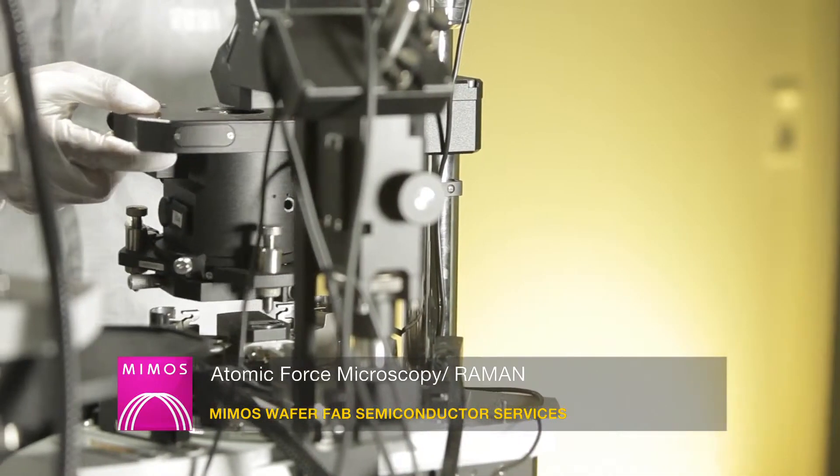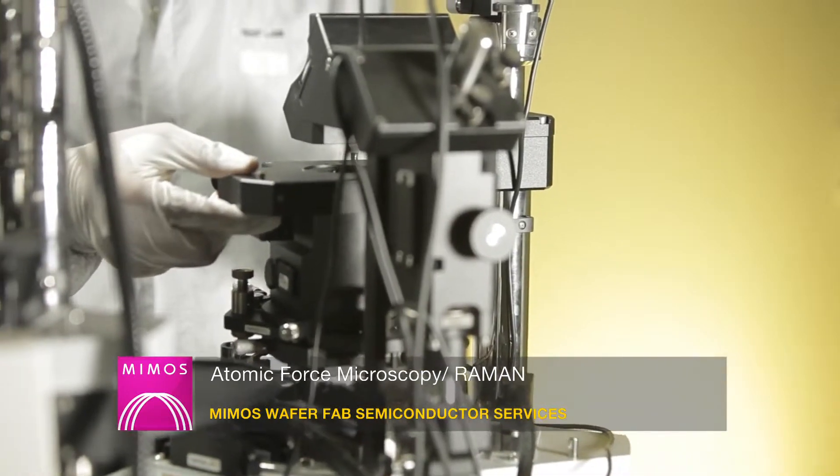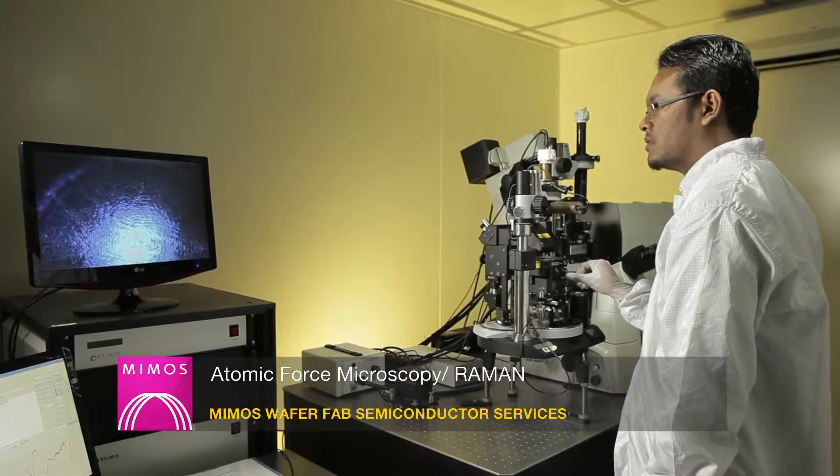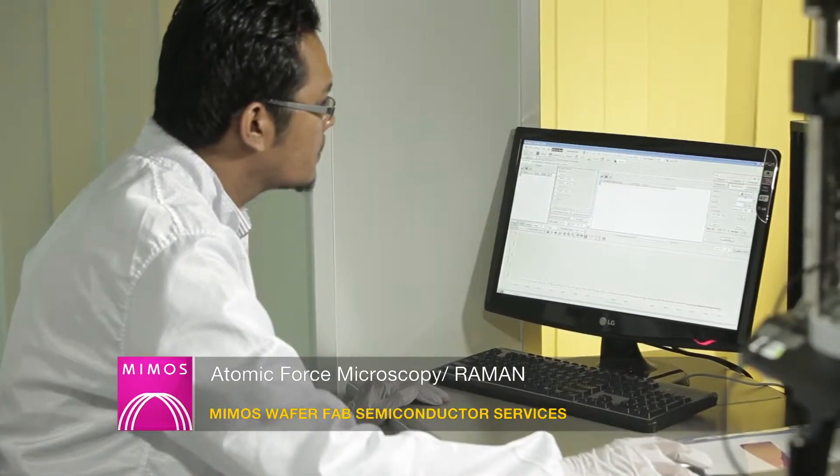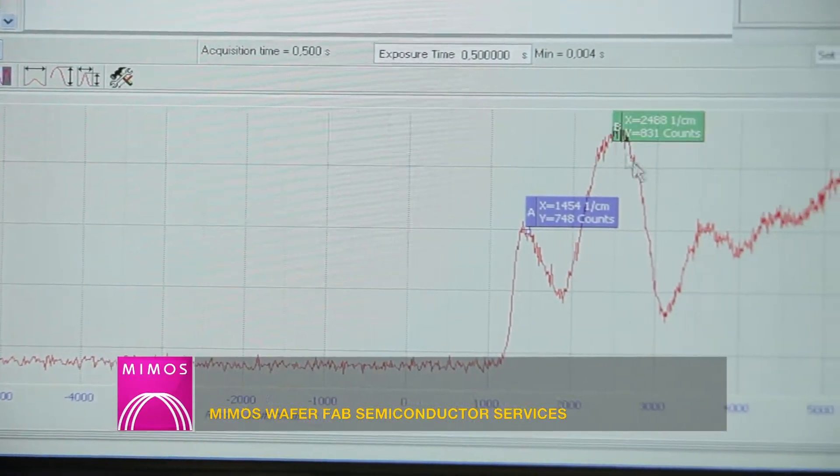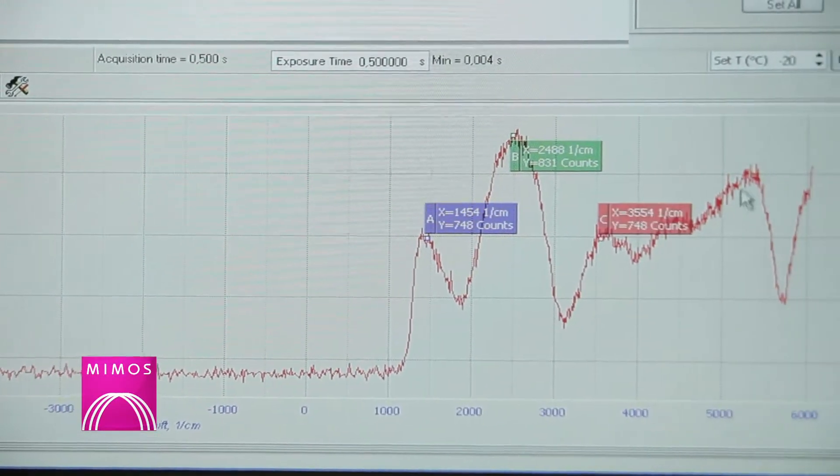An attachment to the atomic force microscopy is Raman. The system has the capability to provide chemical and molecular analysis of solid, liquid and gaseous. Identification of organic and inorganic samples.